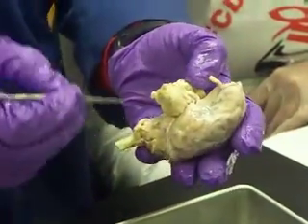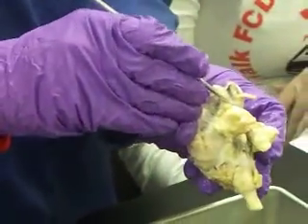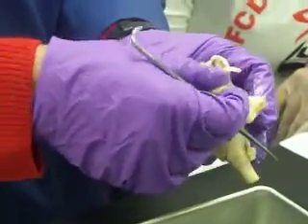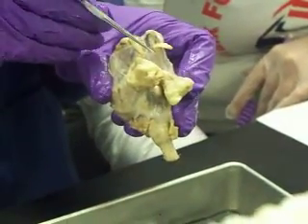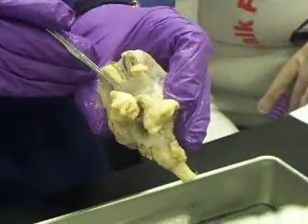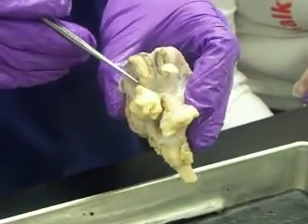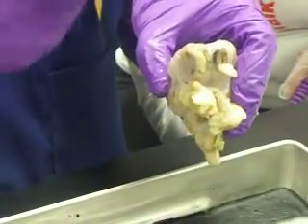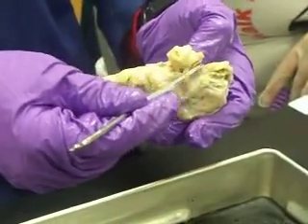But what we can see are the optic nerves here, here, and here. So this would be the right eye where it would be in the left eye. And then that information is transferred to the brain through the optic nerves. Here and here. What's interesting about these optic nerves is that they cross at the optic chiasm, and that means that information from the right eye not only goes to the right side as well as the left side, and same thing with the left. These are olfactory bulbs, by the way, allowing you to smell. So those are two cranial nerves already, optic nerves and olfactory.